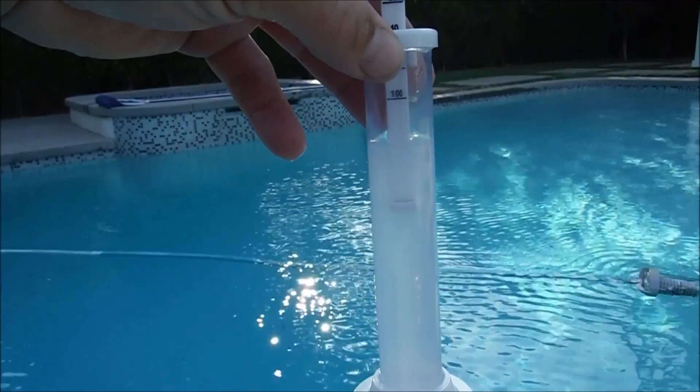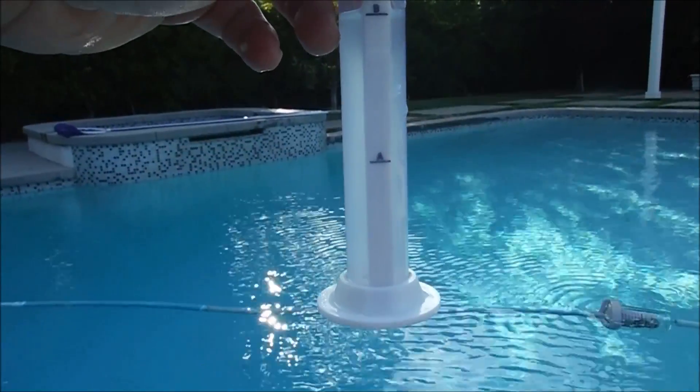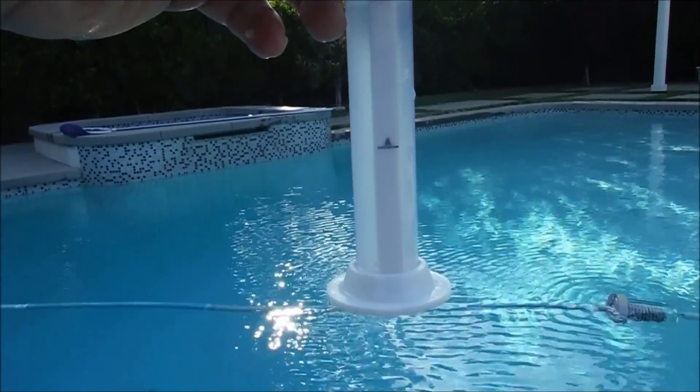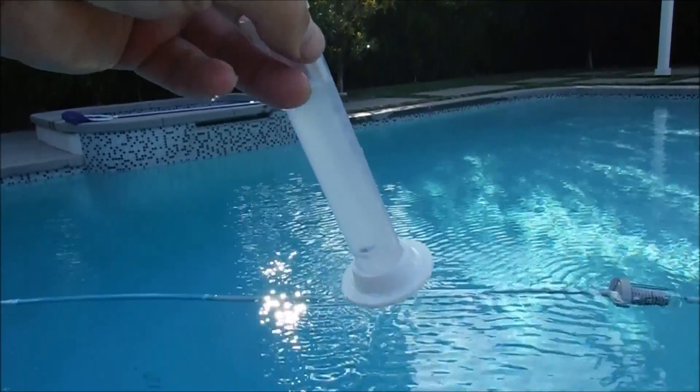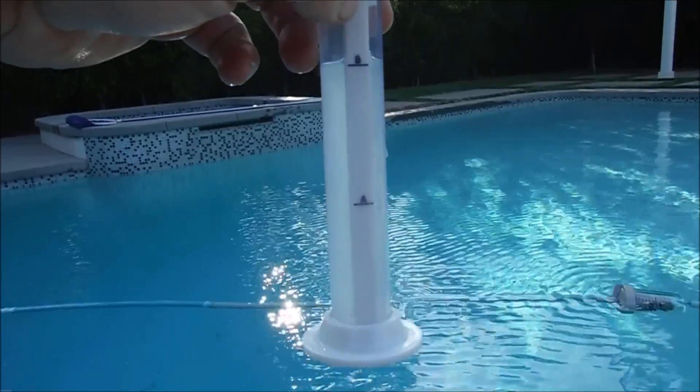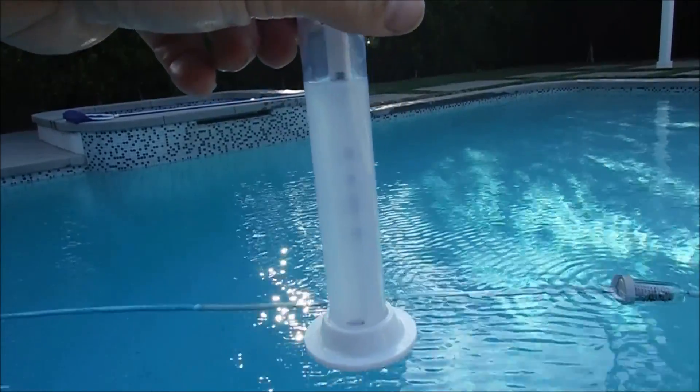And if you do that and it's still coming out below the 100 level mark that means that it's over 200 parts per million. In that case you're going to do a 1 to 2 ratio. One part pool water, two parts tap water and you're going to multiply the results by 3. If that's still coming out below the 100 mark on the tester, we're going to do one part pool water, four parts tap water and multiply the results by 5. And that will be your cyanuric acid level reading.